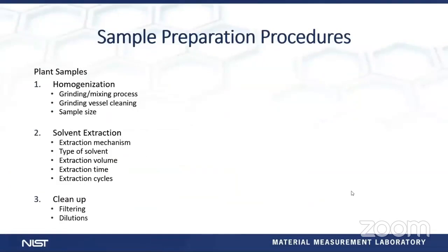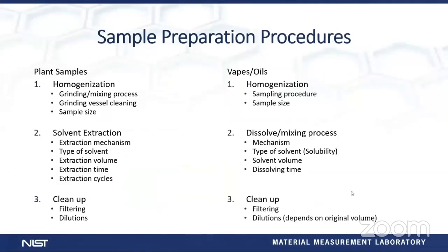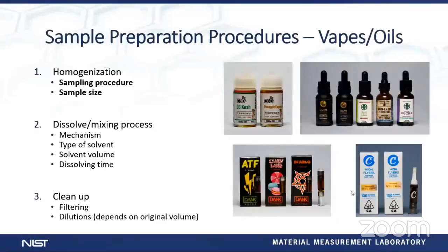So we wanted to tackle it with a similar process as we did for plant samples. If you take that and compare with vapes and the oils, that's where we focused a lot of our work initially, primarily because they're very simple samples to do the sample preparation for. You can see it gets a little bit more simplified because of how the samples are prepared for analysis or prepared for sale on the marketplace.